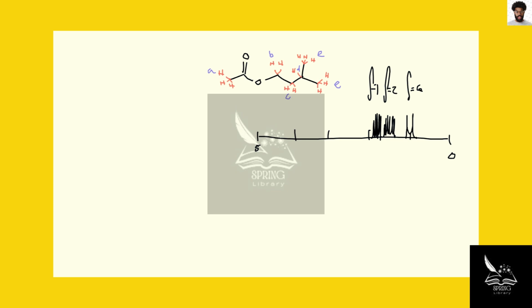At 2.0, there's a 3 proton singlet. And at 4.2, there's a 2 proton triplet.